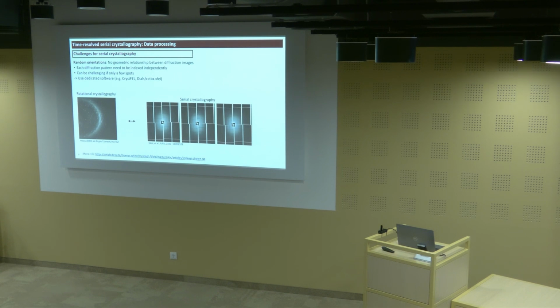So again, here, use dedicated software such as CrystFEL, DIALS, cctbx. There might be others, and XDS, and so on. And this software will contain specific algorithms to index independent images.